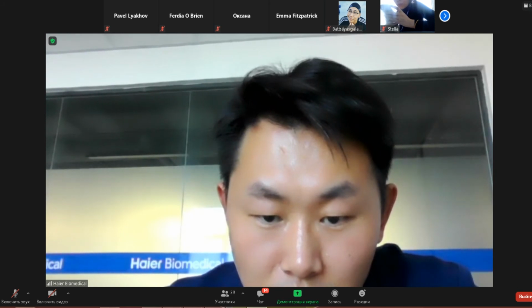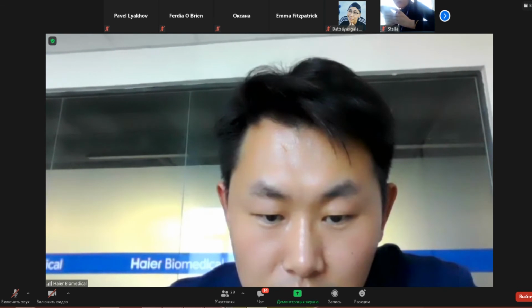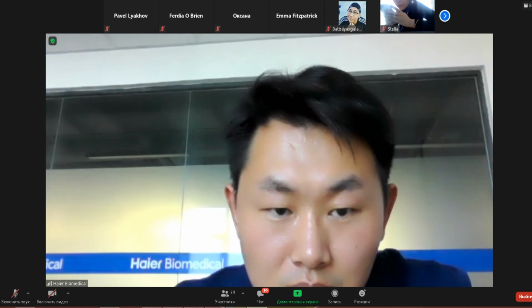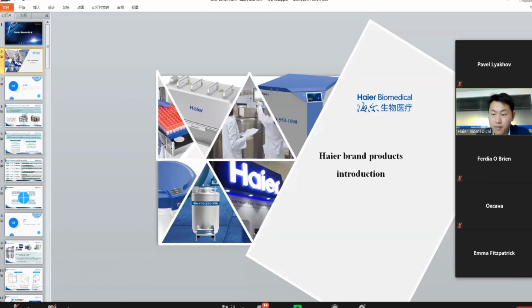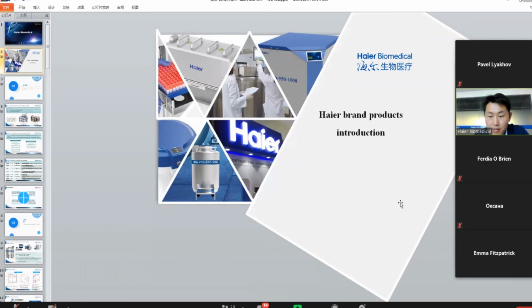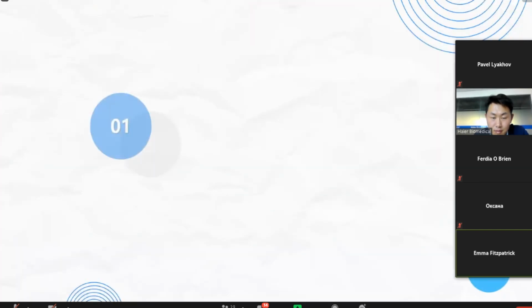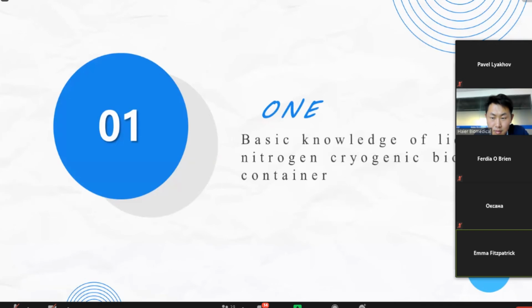I will open the one. The basic knowledge for the liquid nitrogen tank.